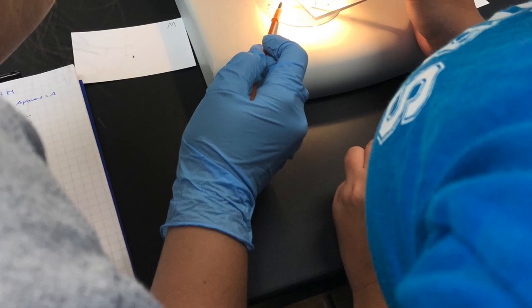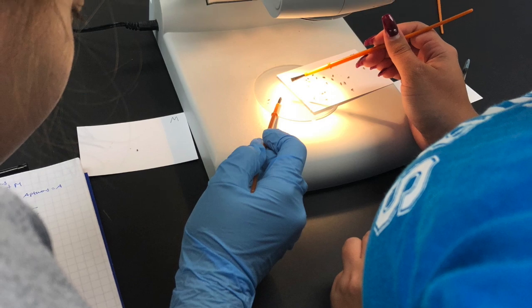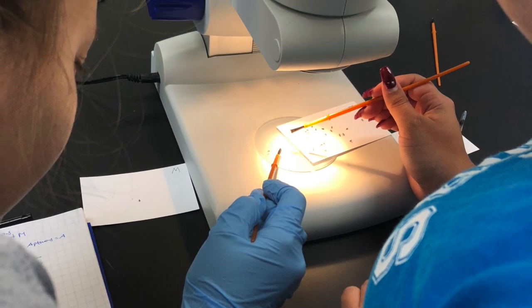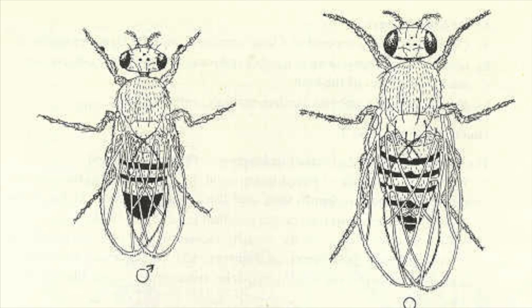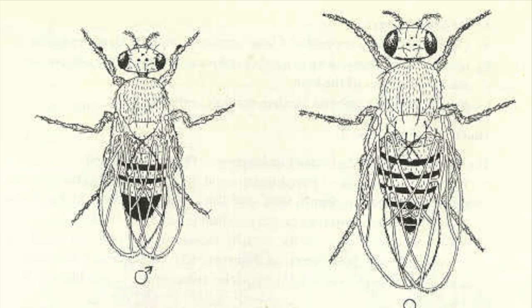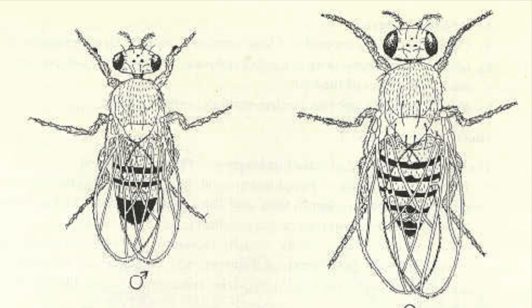Once the flies were extracted, each fly was sexed under the microscope. Male and female flies can be distinguished visually. Males have sex combs that are dark and on their legs, and females do not. That is the most effective way to sex the flies.